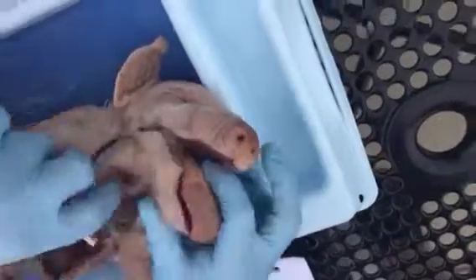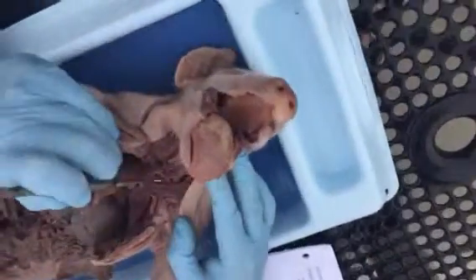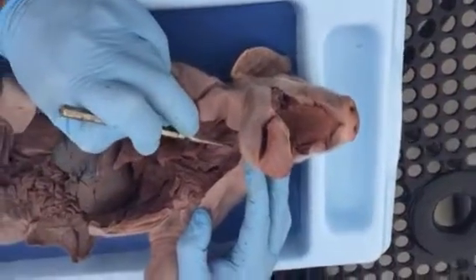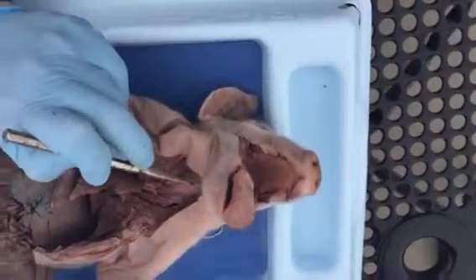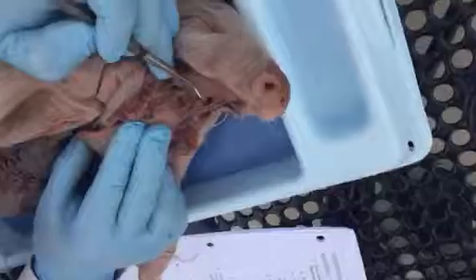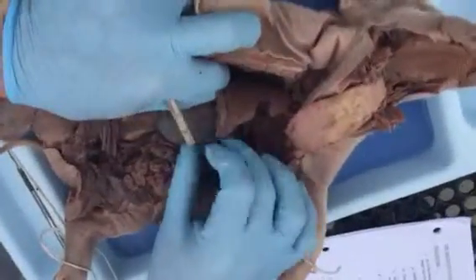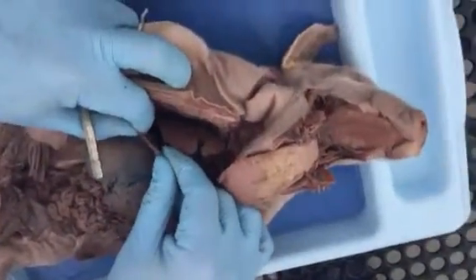Okay, the esophagus, you should know where that is. That's kind of cut here, but this is it right here. That's the larynx. Okay, the epiglottis and the glottis. Again, epiglottis. My probe is in the glottis. Diaphragm sits on the liver.